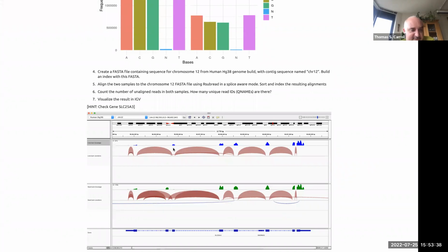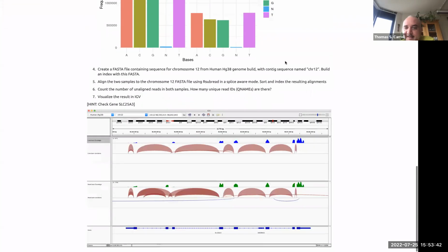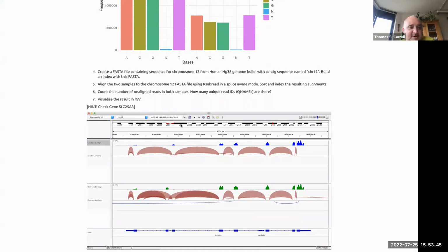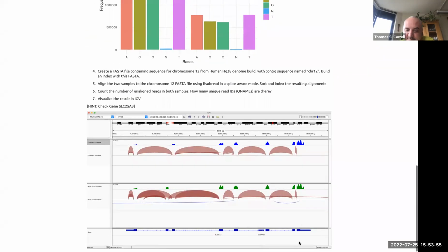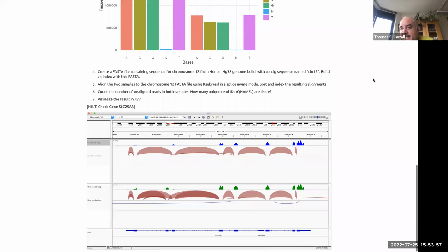That's quite cool. We're going to align the fastq for that IGV we did in the IGV session. But I will come back at 4:30 and run through it anyway. If any of you are still going, you can watch the YouTube video. That will have the solution at the end of it. Just catch up there.